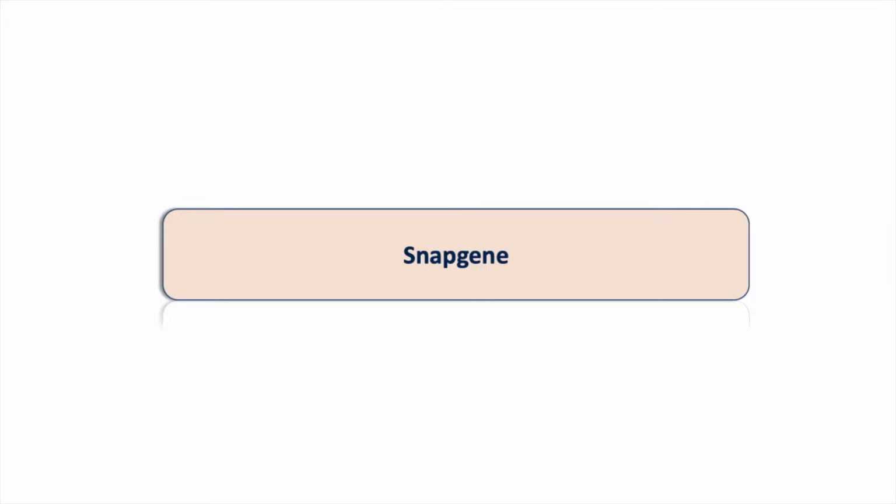I'm going to show you how to use some basic features of Snapgene. For this, I'm going to use the Snapgene Full. So this is the Snapgene Full program. Snapgene also has a free version, called Snapgene Viewer, that I'm going to talk about a bit later.